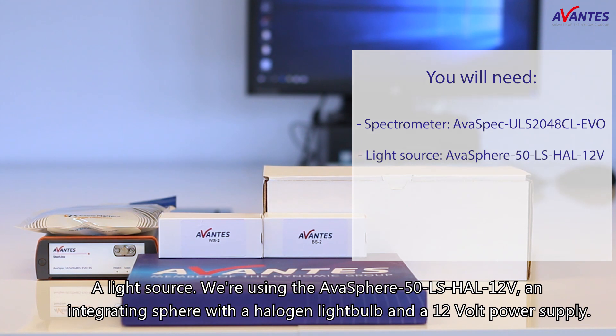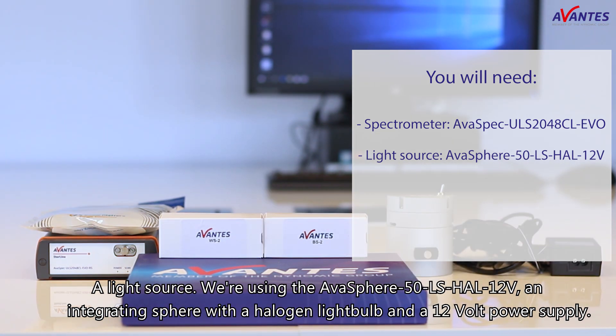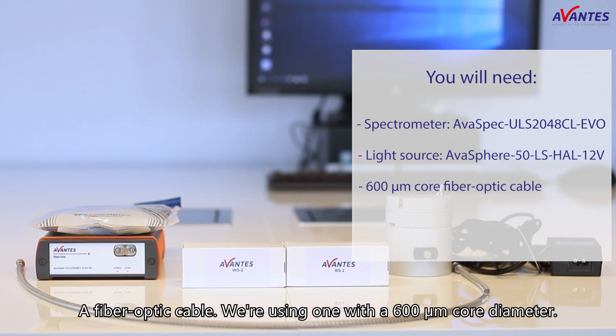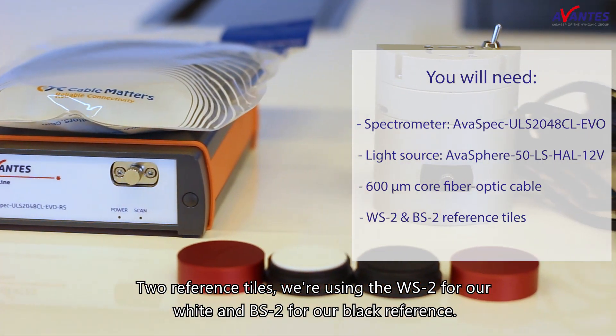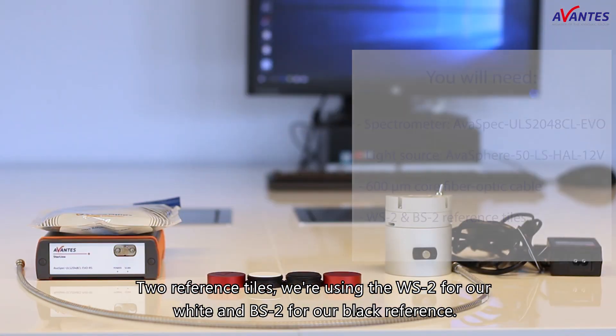A light source — we're using the AvaSphere-50-LS-HAL-12V, an integrating sphere with a halogen light bulb and a 12V power supply. A fiber optic cable — we're using one with a 600 micrometer core diameter. Two reference tiles — we're using the WS2 for our white and BS2 for our black reference.